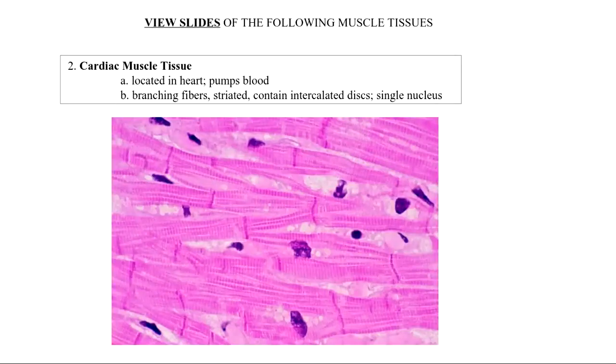Cardiac muscle also has the striations, as you can see. But as you can also see, as compared with the previous slide, it's not quite as organized, a little more branched, right, in terms of how it's organized. It also has these lines here that we call intercalated discs, which sort of adjoin different sections and different cells of these heart muscle cells.